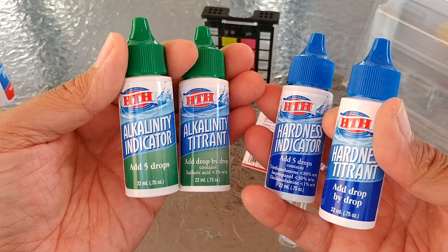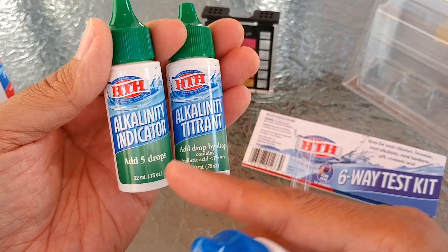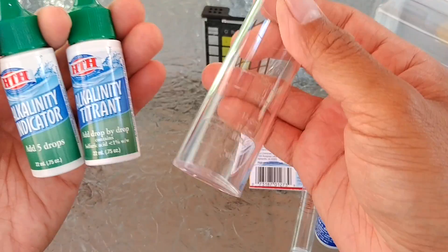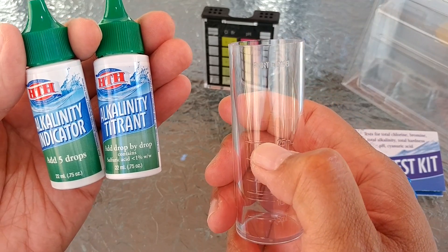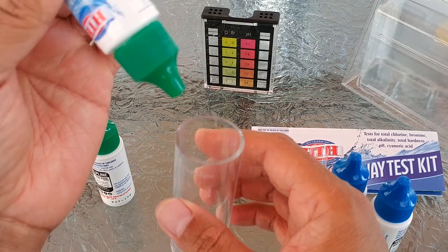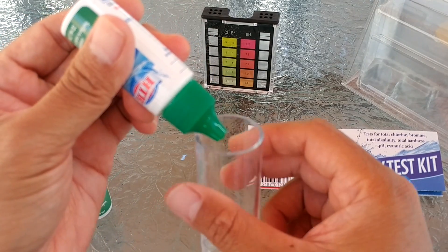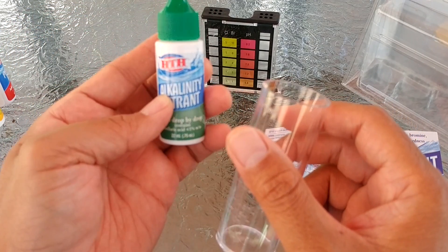For the alkalinity as well as the hardness test, the number of tests will depend on the quality of your water. It requires five drops of the indicator, plus you need to do the titrant drop by drop. You fill the tube up to 25 ml, add five drops of the indicator — it should turn green — then you add the titrant one drop at a time, shaking each time, counting the drops until it turns red. After that, multiply by 10.